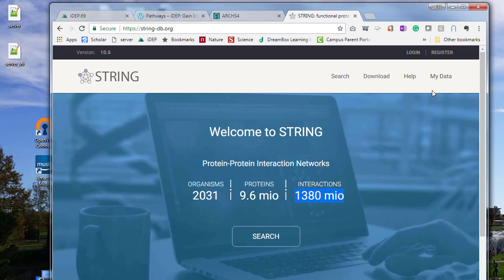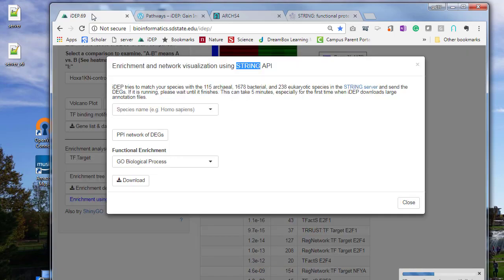resource. One of the things that I encourage you to try with StringDB is, if you have a list of genes, you can paste it here, and StringDB will retrieve the gene expression, the protein interactions, and also conduct enrichment analysis. As you notice here, this is very slow.